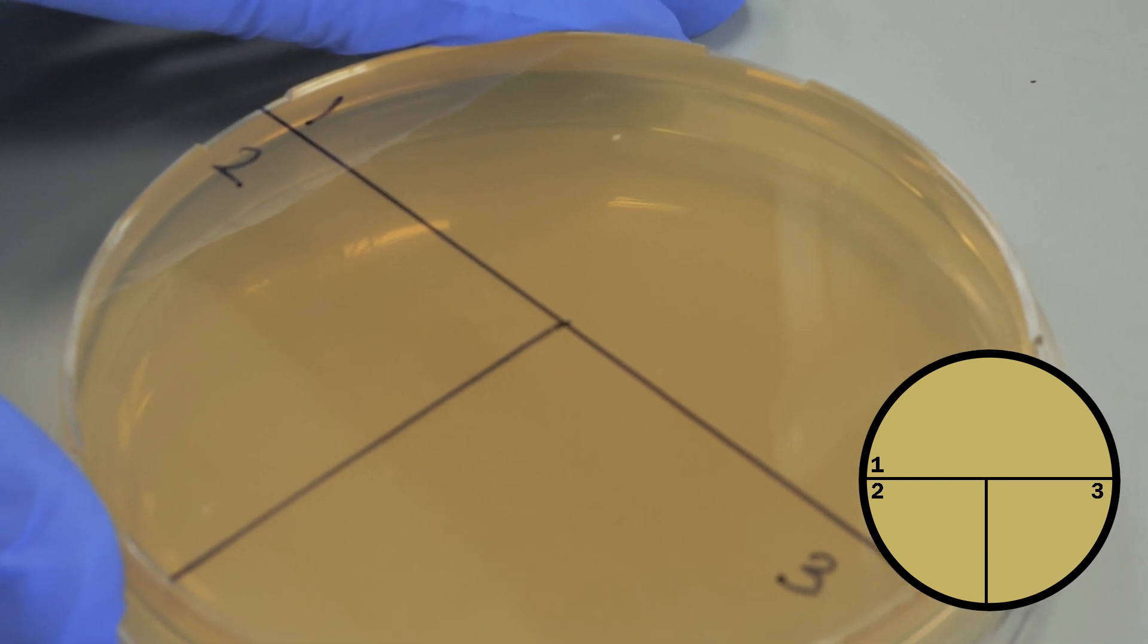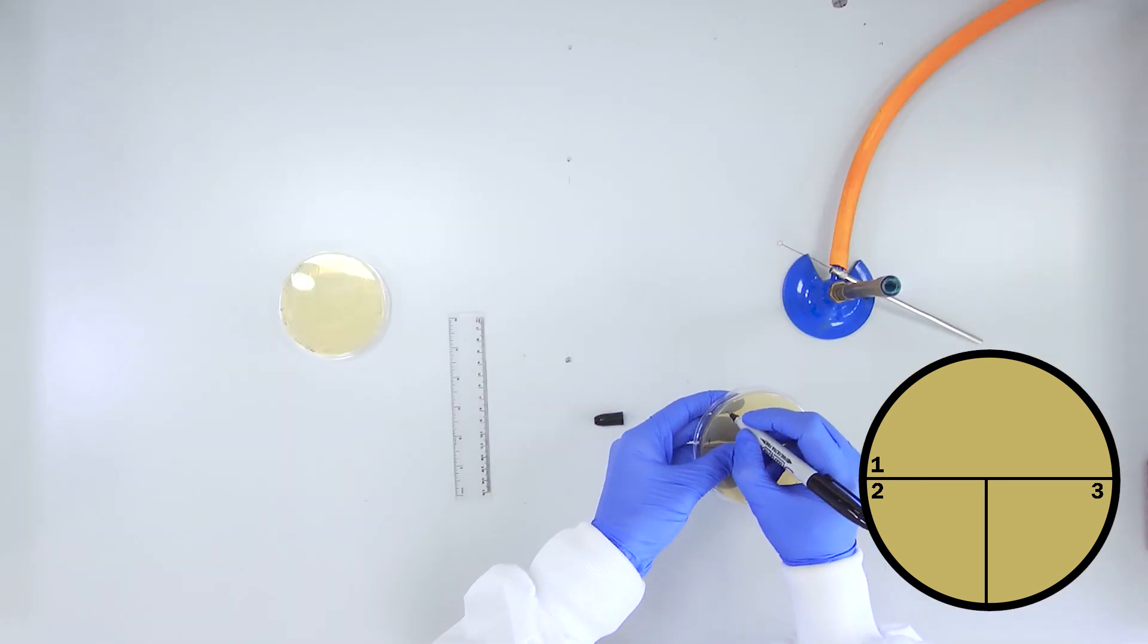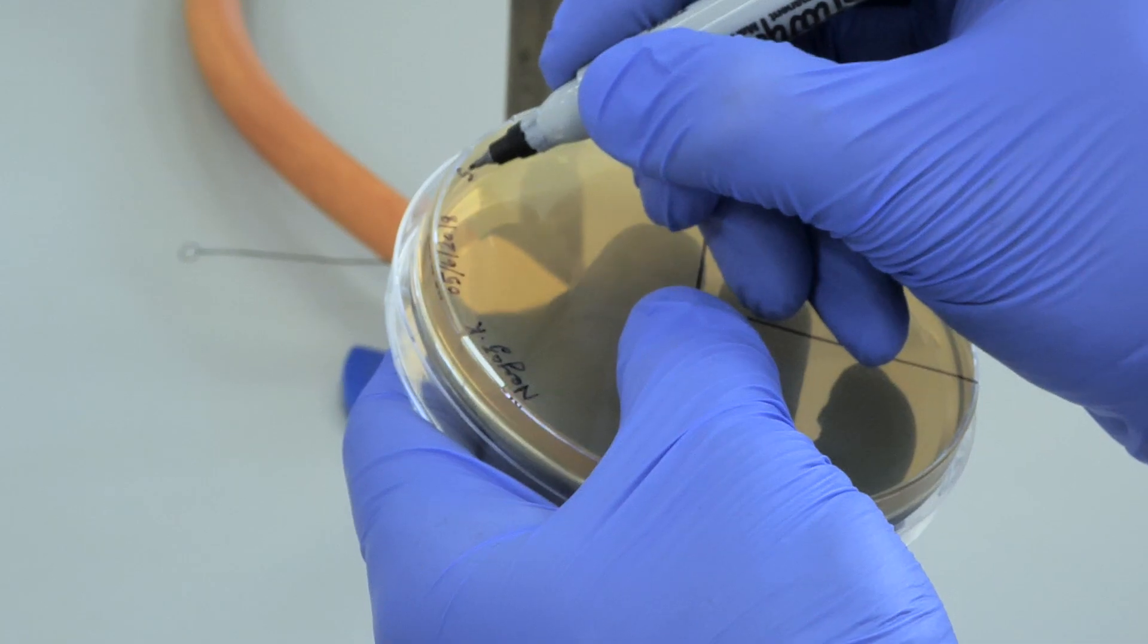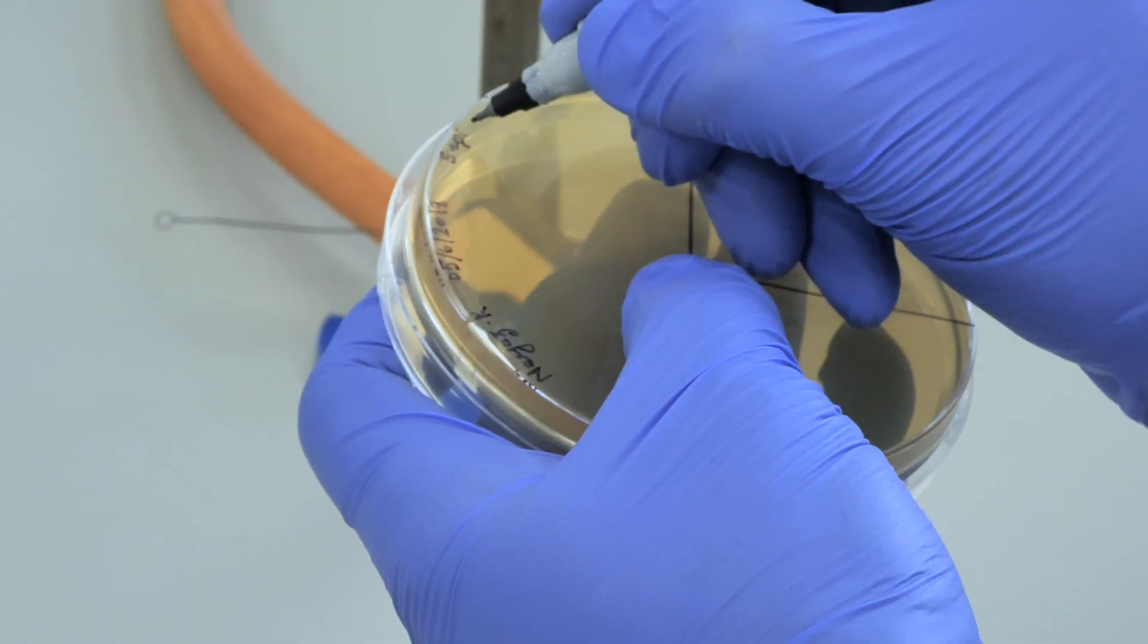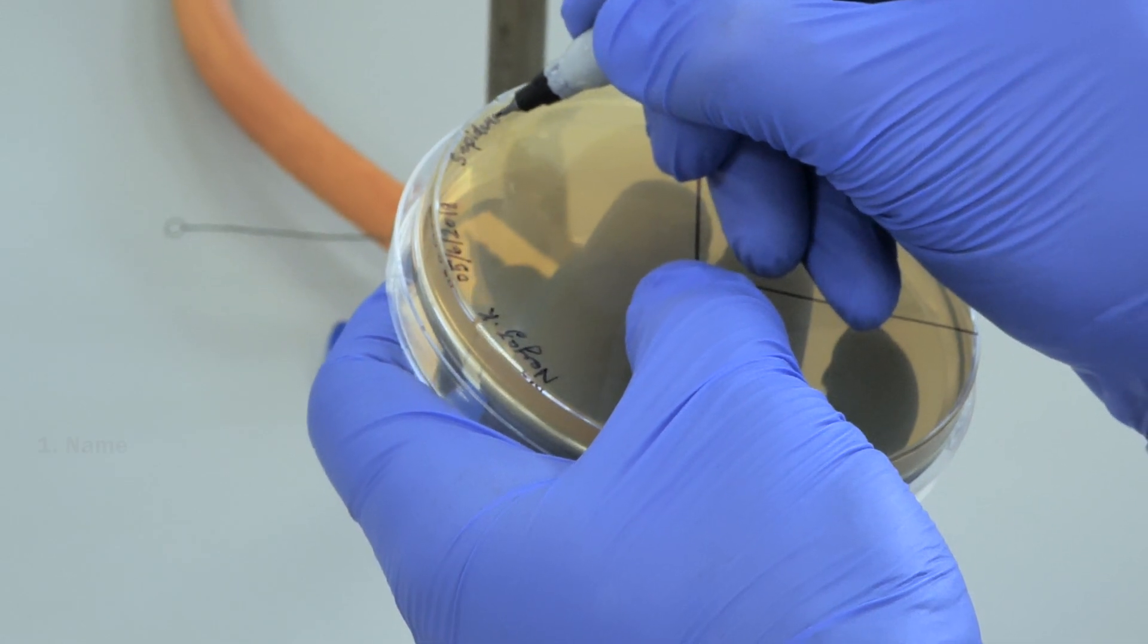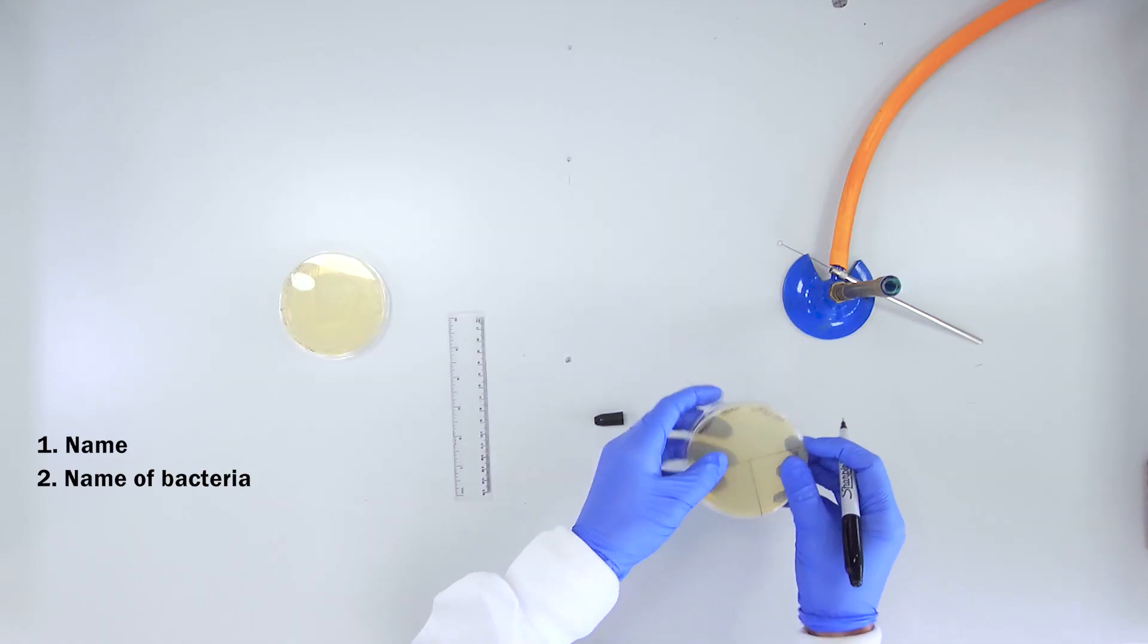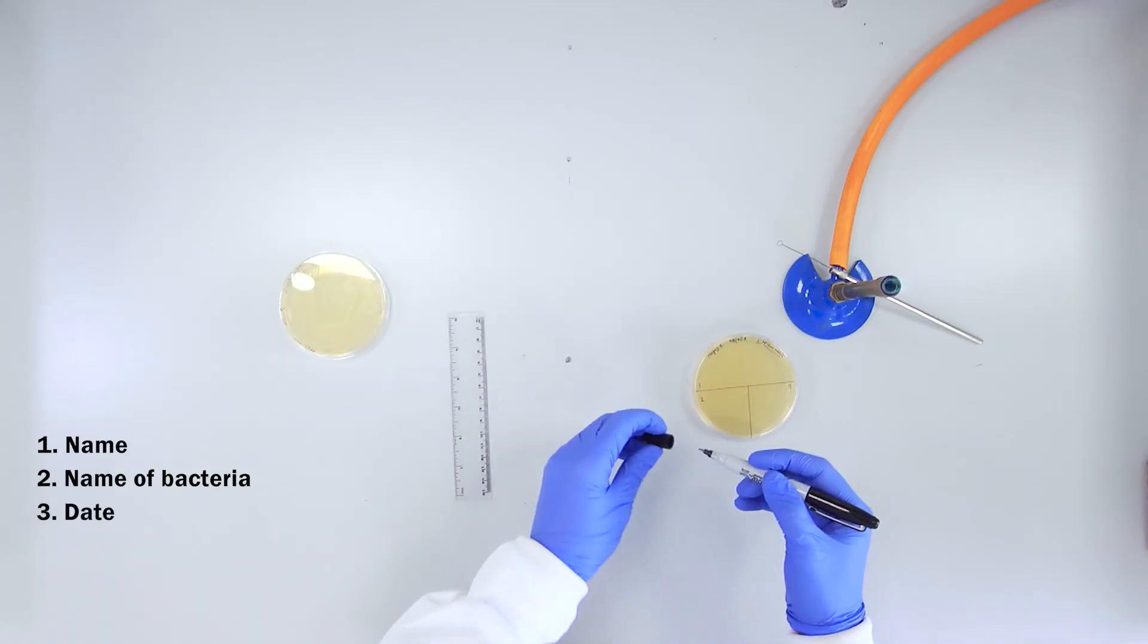Label the bottom of your TSA plate around the edge using a permanent marker. The following details should be included: your name, the name of the bacteria, which will be underlined to denote italics, and the date.